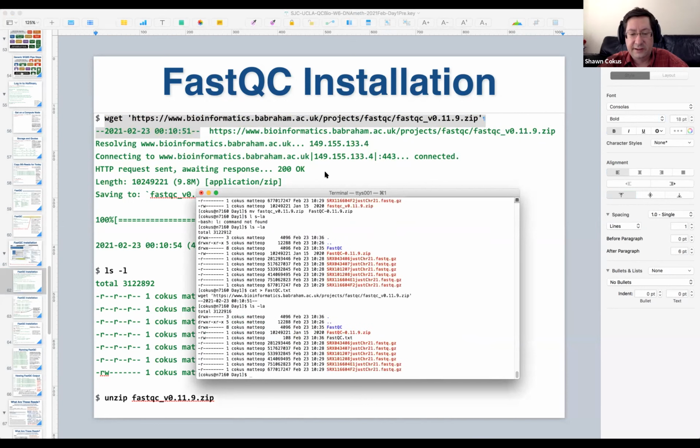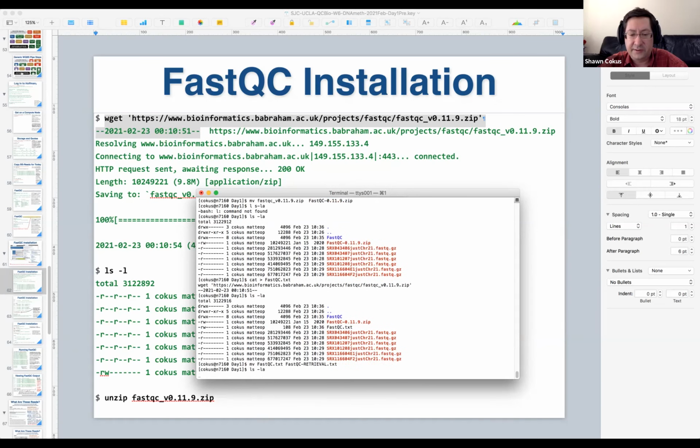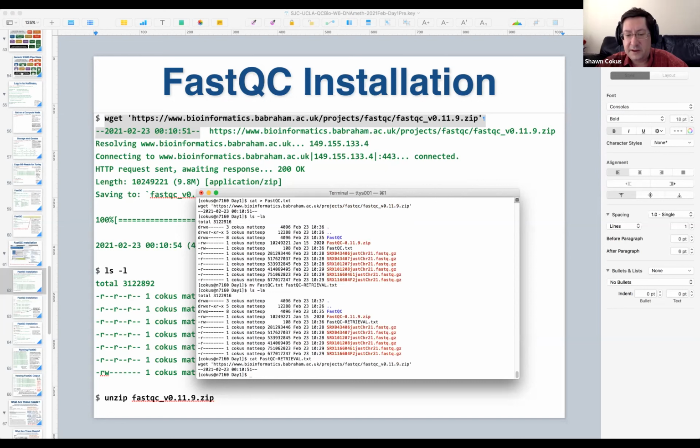And now we have a little log file that tells us what we did. That's a way to take sort of lab notes that you can come back to and reconstruct what you did. So now I have a little file that has my notes as to what I did and when I did it. And that's how we got that zip file.